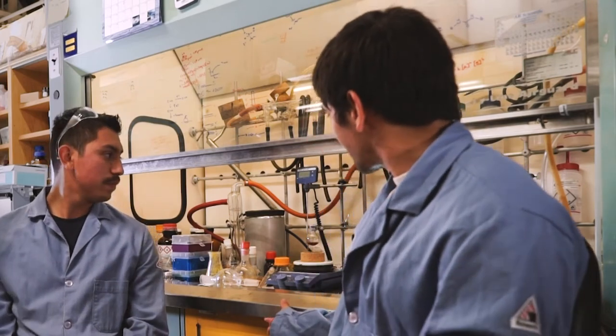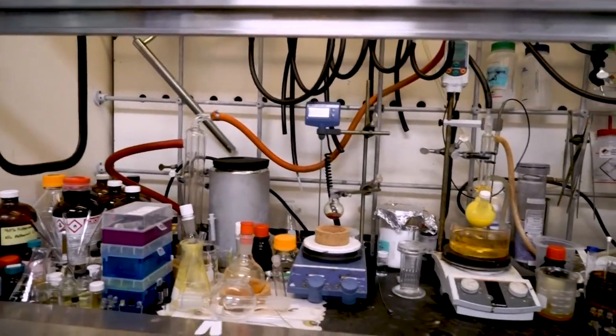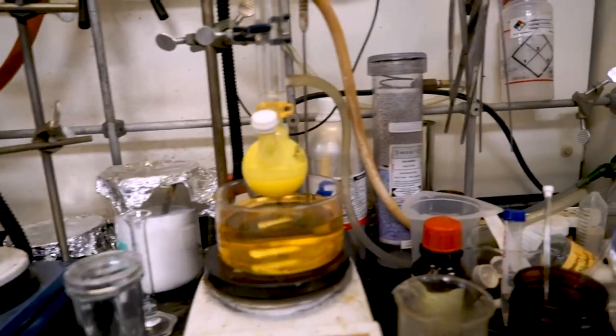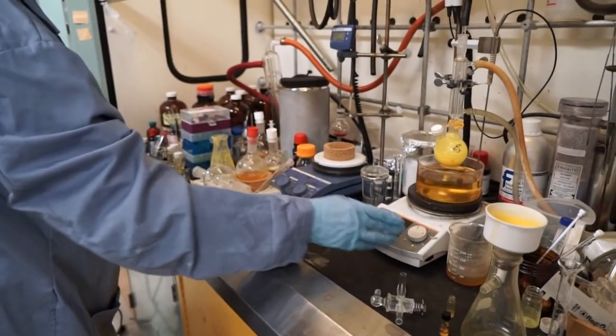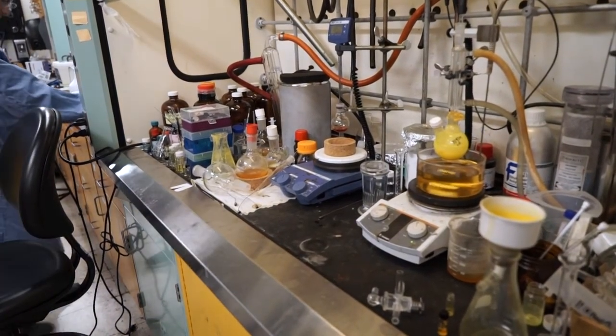Behind us we have two reactions going. The one on the left in red is actually one of our analogs that's non-fluorescent but because of its absorption properties we think it might have some interesting application with absorbing high-powered lasers. And then on the right is one of the steps in making the synthesis for a compound that by itself is not very fluorescent but becomes fluorescent when it's in double-stranded DNA.